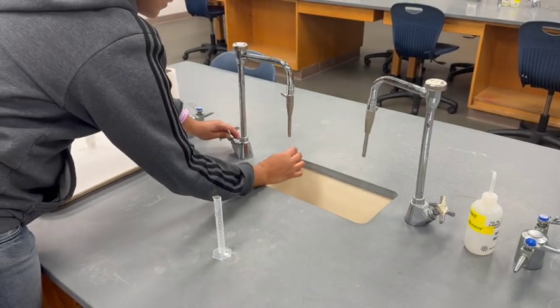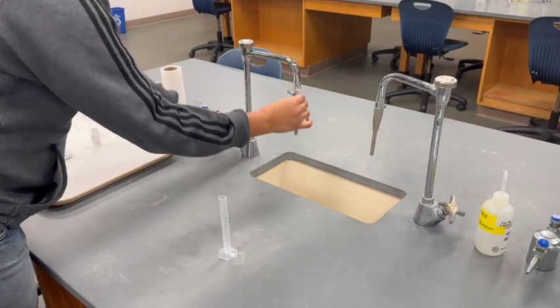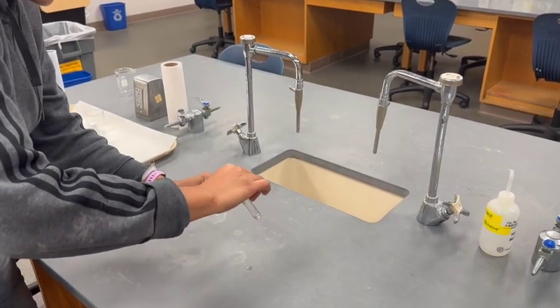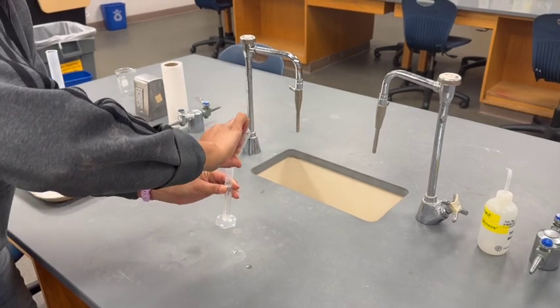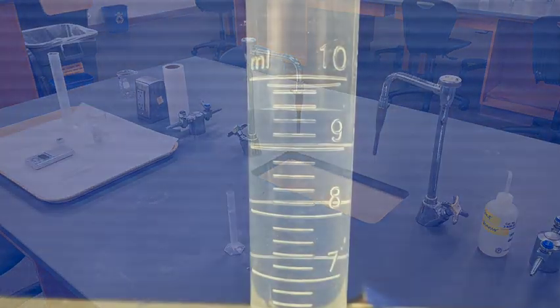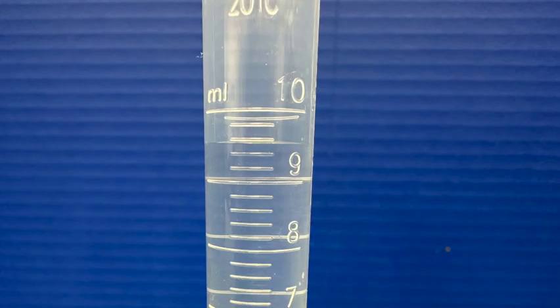Completely fill a test tube with tap water, then pour the water from the test tube into the 10 milliliter graduated cylinder. Using a piece of paper as a background makes it easier to read. The surface of the water is flat, but if you see a curved surface called a meniscus, use the lowest point of the curve.